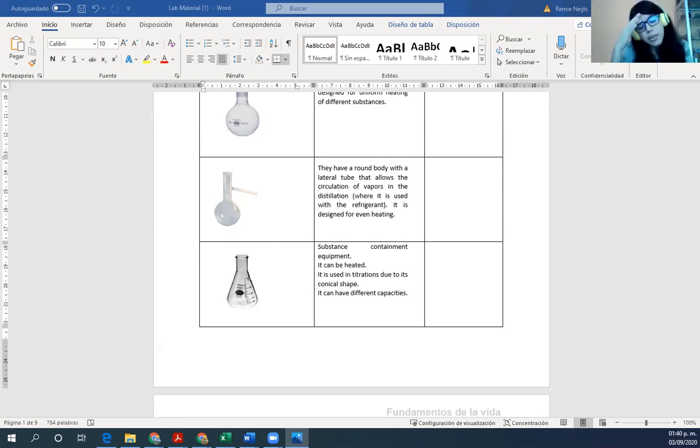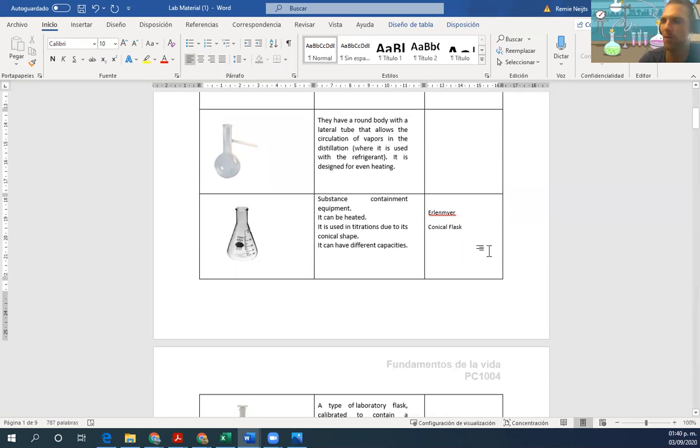I just know the name in Spanish, but Elevator Flask. Yeah, the most common name is Erlenmeyer. Not even flask, just Erlenmeyer. What they also call it is a conical flask. Could be another one. I'm not going to give you all the answers. I'm just helping out a little bit so that you have less homework.